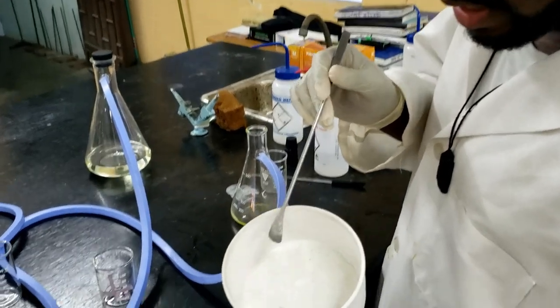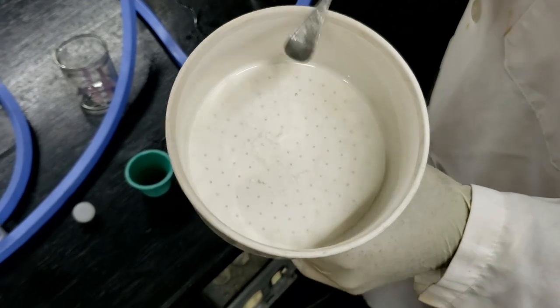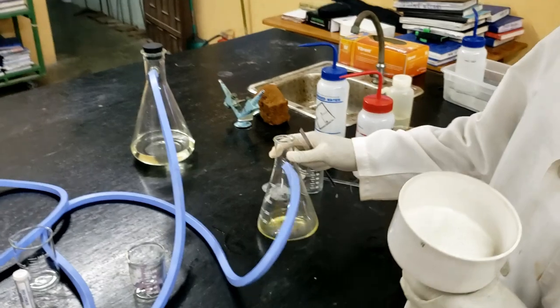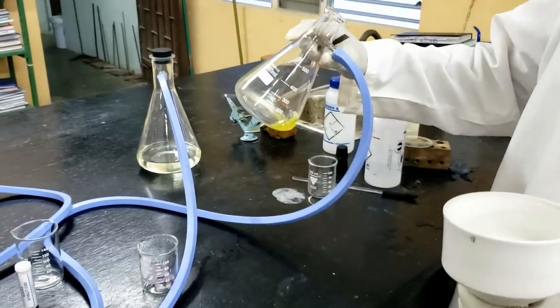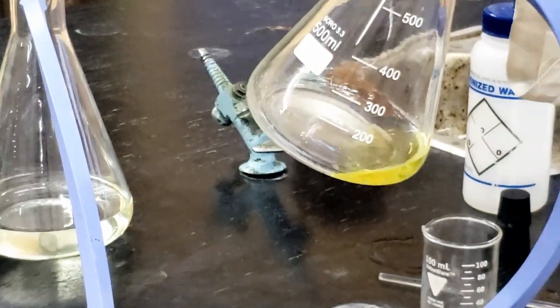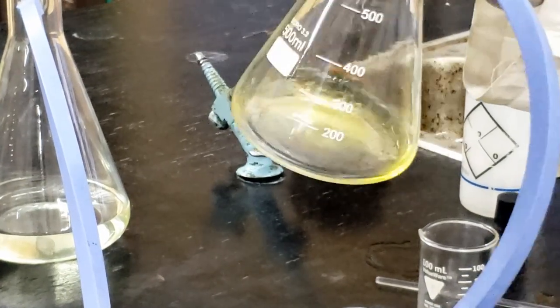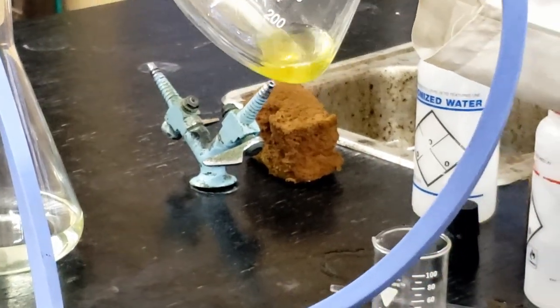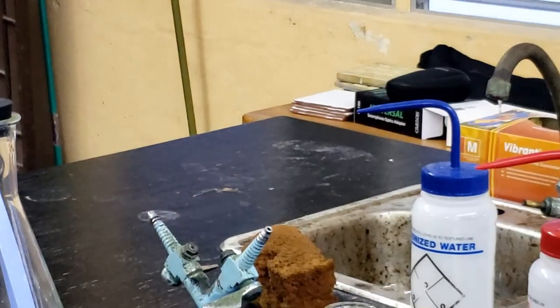So I have a bit more solid. I'm gonna go add this and weigh it with the other amount of the solid, which is the p-bromonitrobenzene. And I also have some more mother liquor, a second crop. Now with this, this should be a little over 10 mLs, and we're gonna evaporate it down to about 4 mLs. And once we evaporate down to about 4 mLs, we should get an oil forming, which we will separate with the micropipette, and that should be our o-bromonitrobenzene.